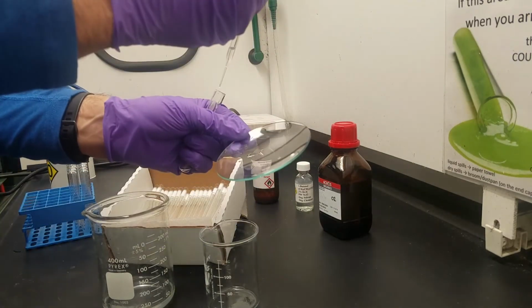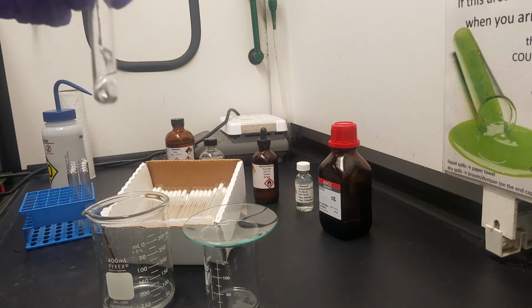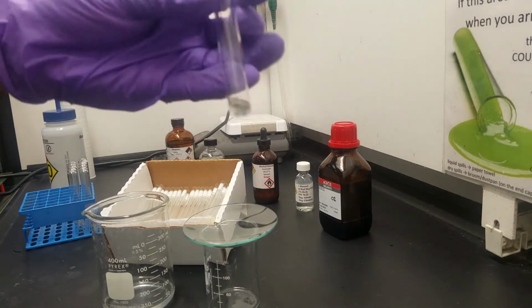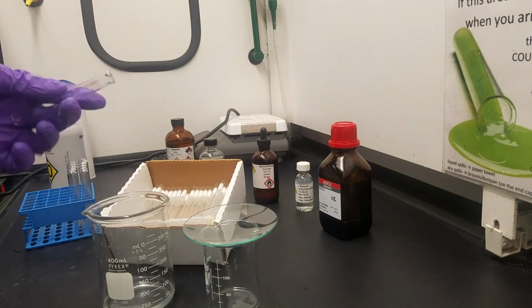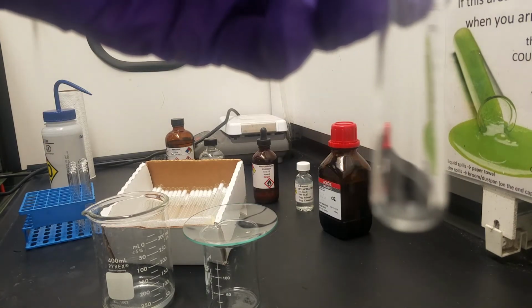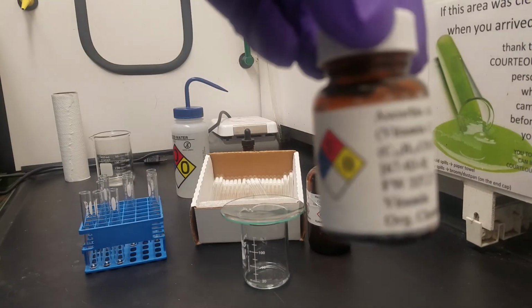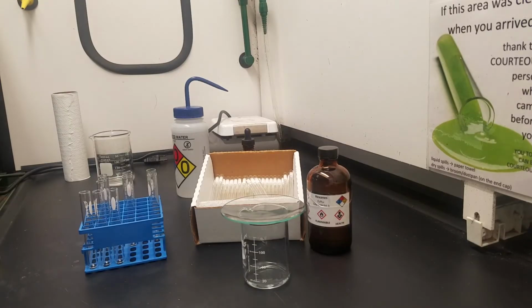The next thing that I went through and did, because I wanted it really bone dry, was rinsed it with hexanes. Hexanes has an even lower boiling point than the ethanol, and I wouldn't do it right away because hexanes won't get rid of the water. Right? Because hexanes and ethanol are soluble, hint, hint, that sets up that test tube for part 3, where we're now going to kind of apply our knowledge out to a bunch of vitamins to see if we can't predict something about their structure based on their solubility in a variety of solvents.